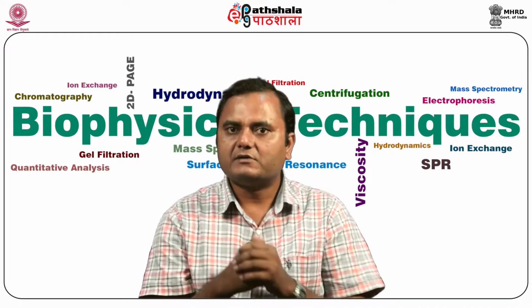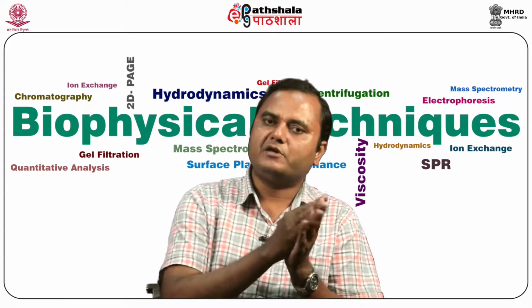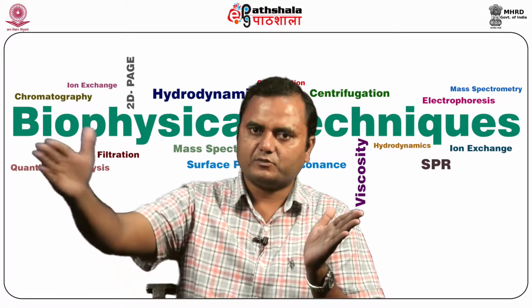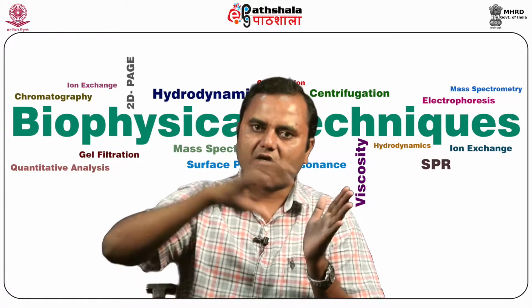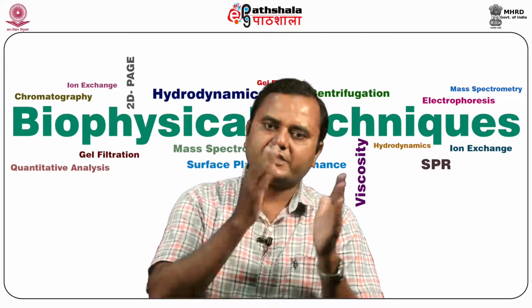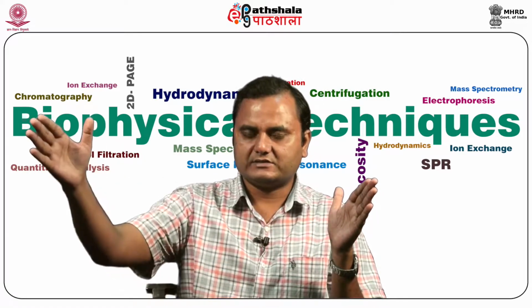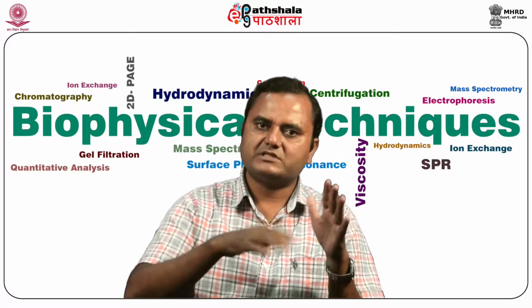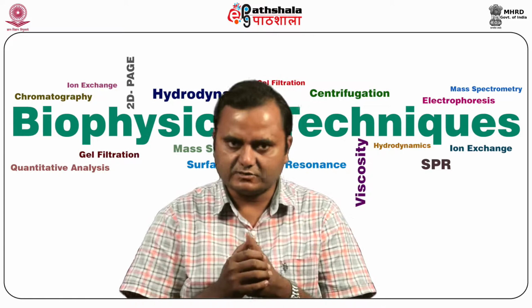Similarly, for biomolecular conformational changes, for example, if you take a protein and you want to see whether it is denaturing during the course of time or during the addition of certain salt or anything, you can take a dynamic picture of how the molecules got denatured, because during denaturation the conformational changes occur and the size changes.